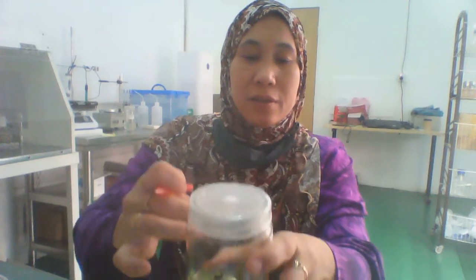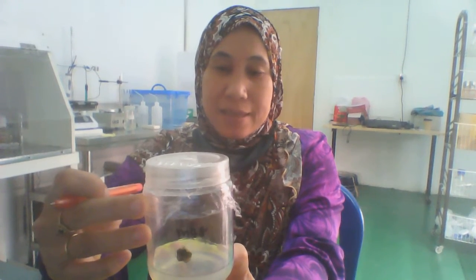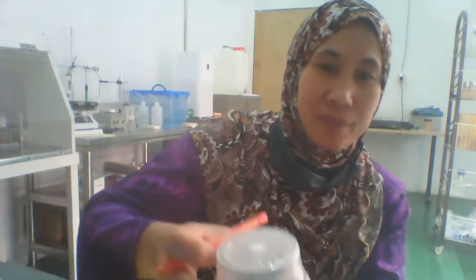This is all the culture that I cultured yesterday, a subculture, and this is banana subculture 3. This is peace lily, variegated peace lily, or Spathiphyllum sensation, subculture 8.